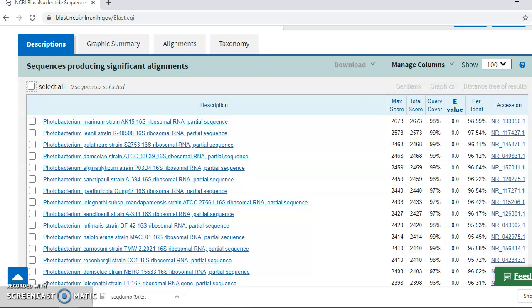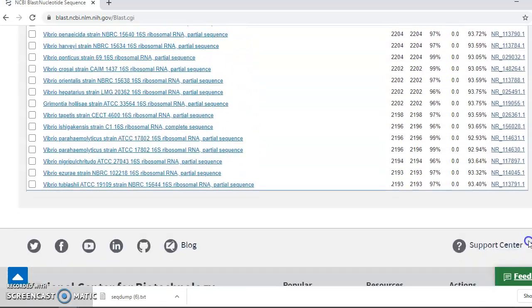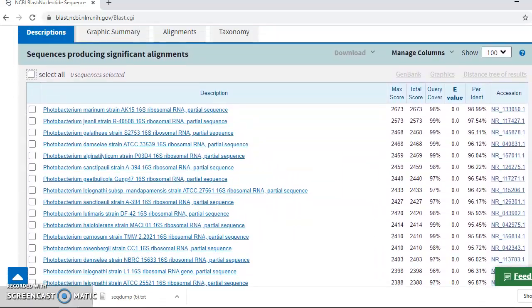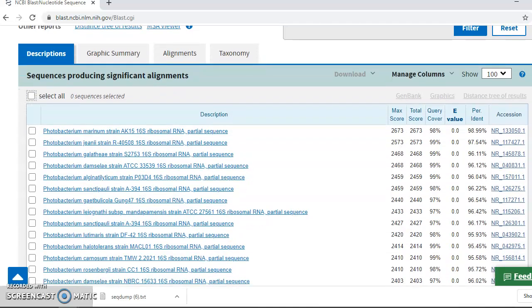In order to build an optimal tree, the percentage identity must be far from each other. But unfortunately here the percentage identities are all above 90%, so we must choose 10. So firstly I will choose the 98%.